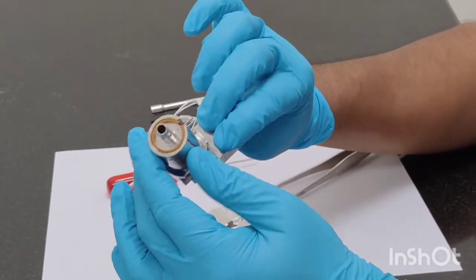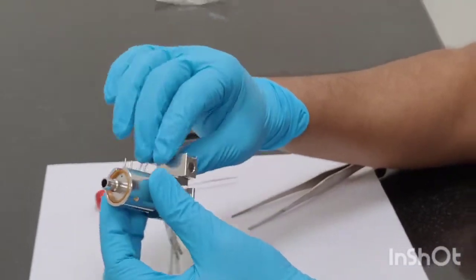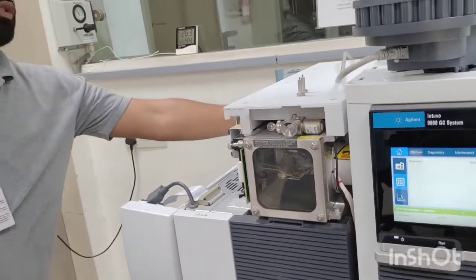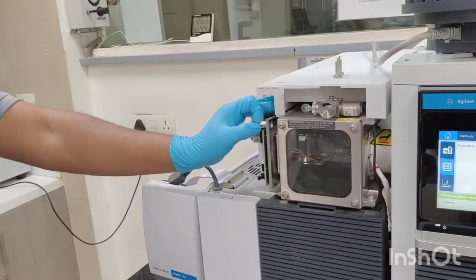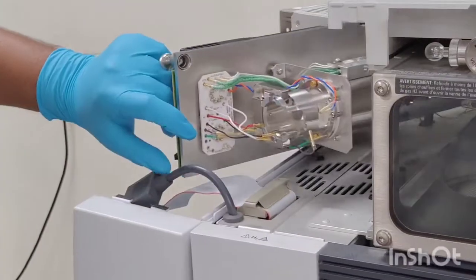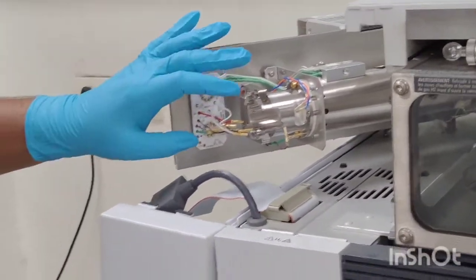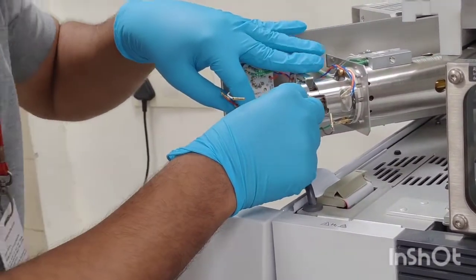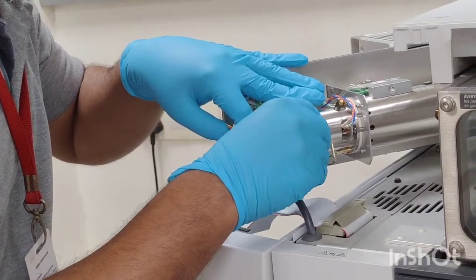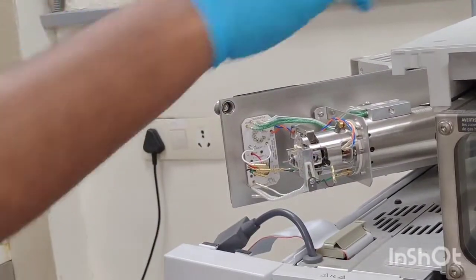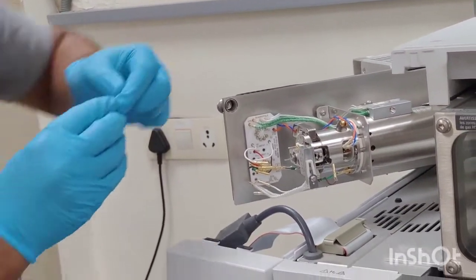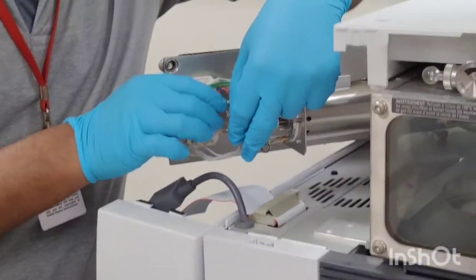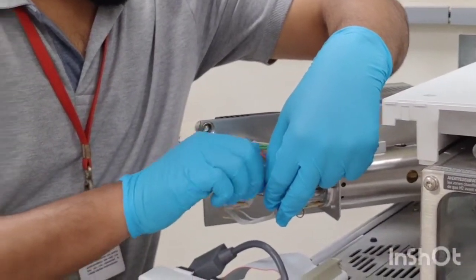Now the ion source is ready to be fixed in the MS part and we will go back to the screw again, which the screw is already open and opening this part. Then you can see we can fix the ion source like this. When it is properly fixed, take these two screws. There is no need to use any screwdriver here, just we need to hand dial it.